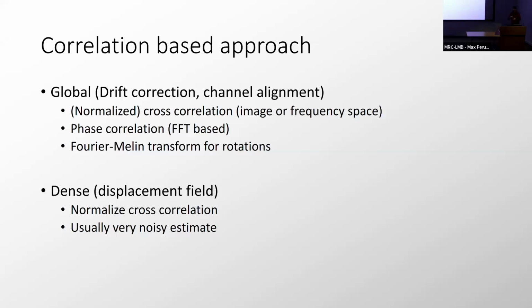This often doesn't impose any smoothness on the resulting vector field, or displacement field, so it's often very noisy. The smoothness is linked to the size of the blocks you are trying to match. The bigger the blocks, the more regular the result will be. The smaller, the noisier, but more precise at detecting small distortions.